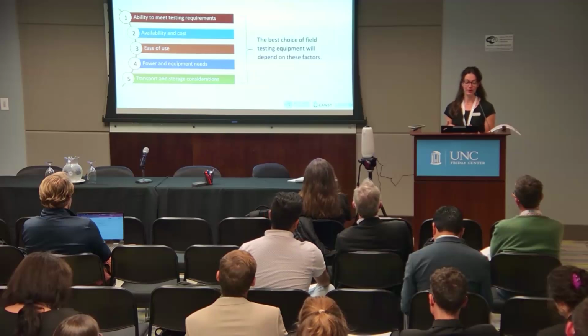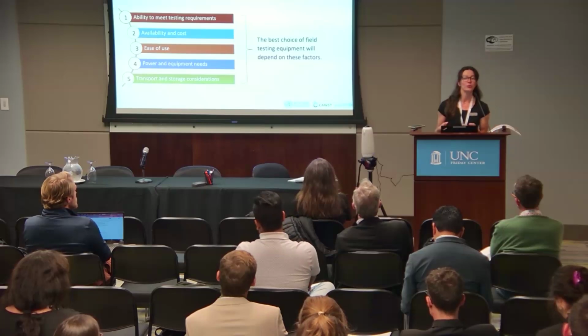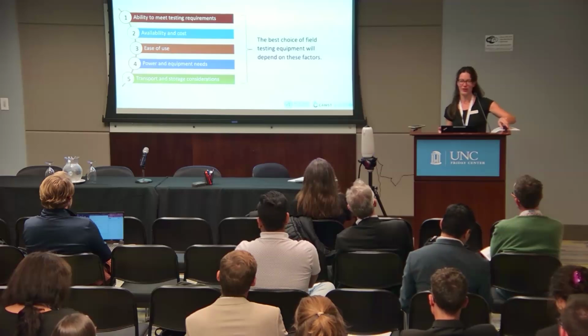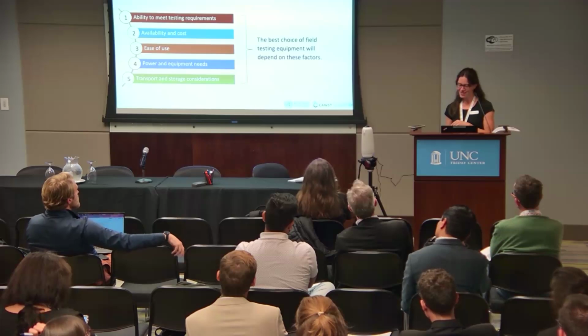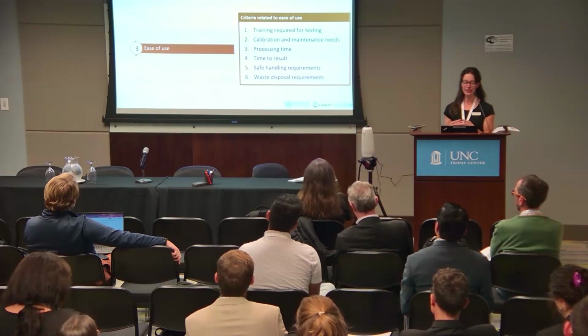And for example, category 5, transport and storage considerations. Do you need a cold chain to keep your media cold? How long is the shelf life of some of your reagents? Will you be able to use them in that time? And then, of course, things like supply chain, which was also mentioned a lot, and I think we've all had struggles with the supply chain, especially post-COVID. So just to demonstrate our thinking on some of these categories.